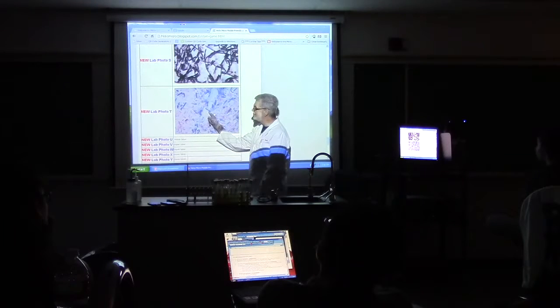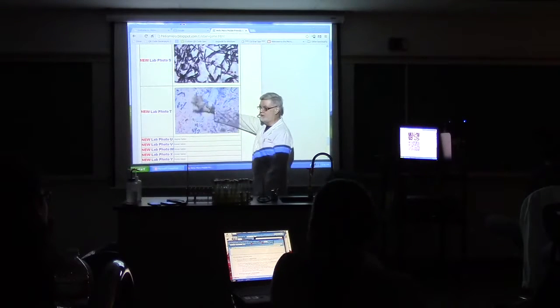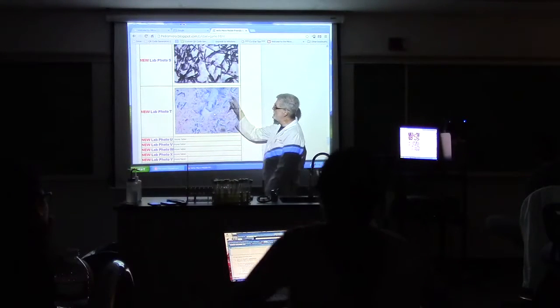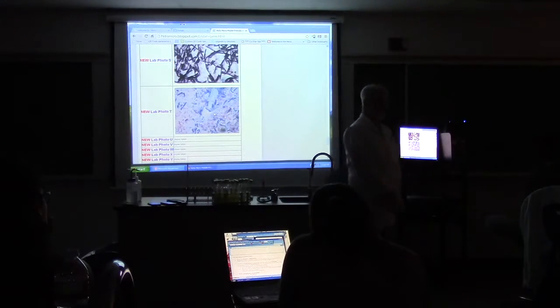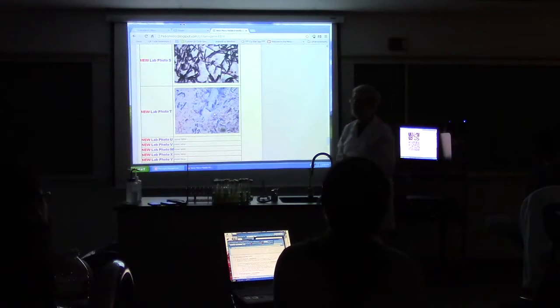Why? What is the cell stain? Endospores are egg-shaped, and they're not cells. So they are not hot pink. It doesn't matter what they are. They're not cells. So everybody understand how to read this one? Baby blue rods makes it what? Negative. All right, so one last thing on acid-fast, and that's the correct nomenclature, but I want you to forget it.